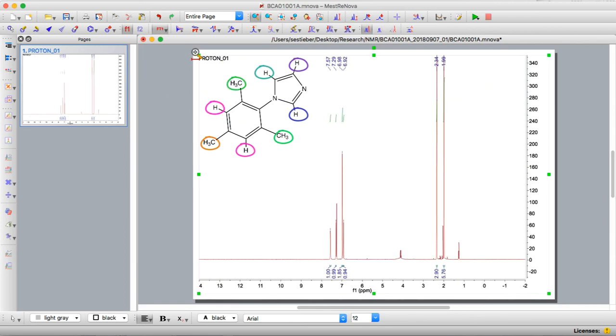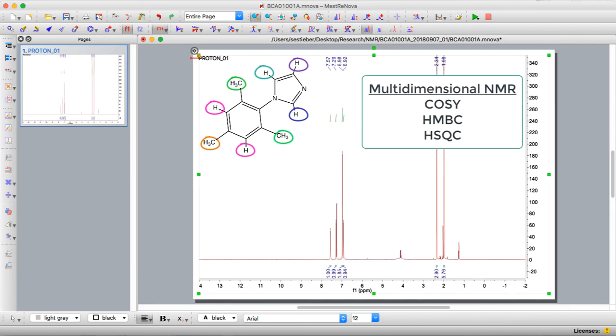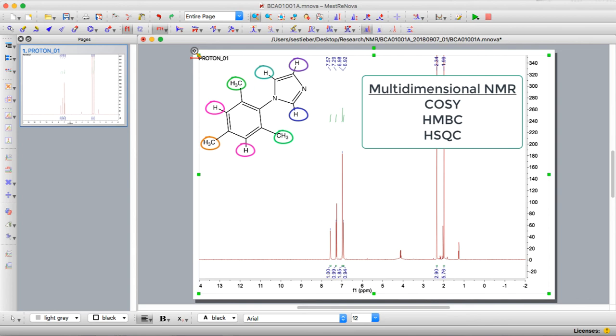Some ways to do this you could do multi-D NMR, you could do COSY which is proton-proton, you can do HMBC, HSQC which are proton-carbon spectra, and those can help you figure out which protons correspond to which positions on the molecule.